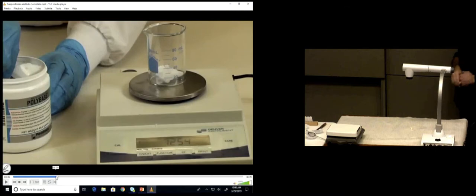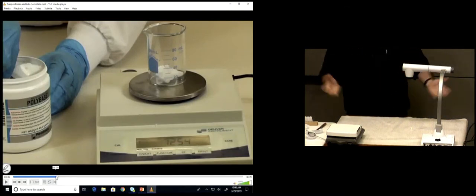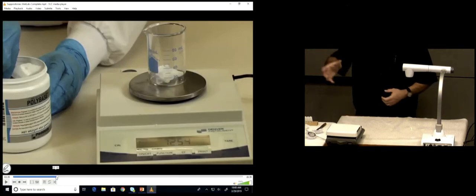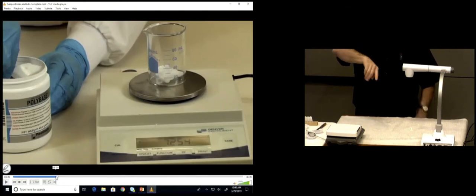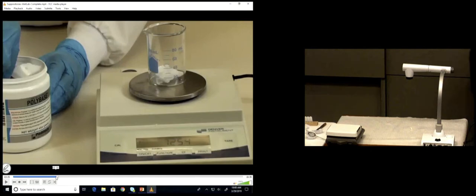I can always tell who doesn't listen to me because somebody just yanks out the big tall 400 mil. You think it's a glass beaker? Who cares, right? Well, you go microwave it and then you're pouring, pouring, pouring, and it's slowly coming down that big long glass thing and you can't get hardly any of it back out. So trust me, there's a reason for this. Use the small glass beakers for all your steps today, okay? For both of the ones here and the whole procedure.